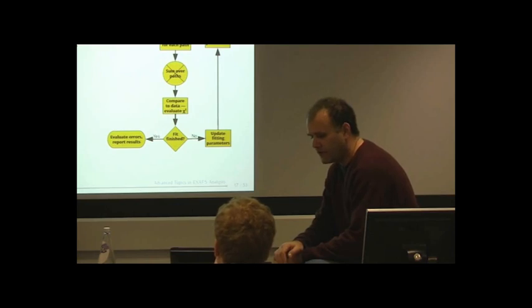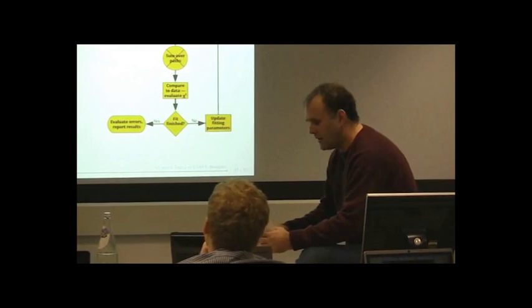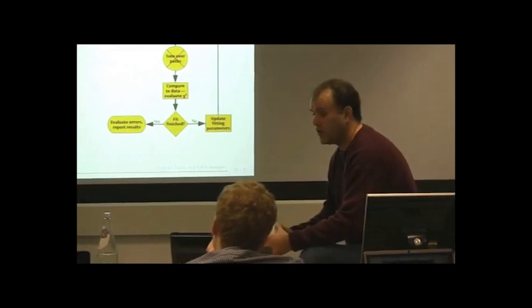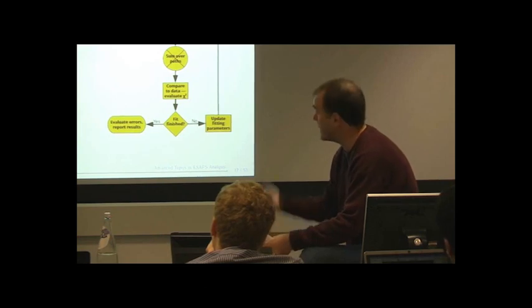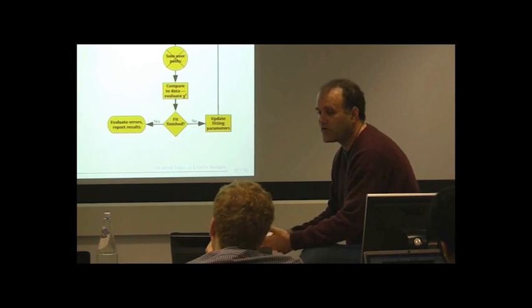What I mean by that is that it's not that you can or can't fix it. Mechanically in the program, you can always fix it or not fix it. It's just a matter of toggling guess to set. So as far as running the program, you can do whatever you want. It's up to you at the end of the day to defend what you do.